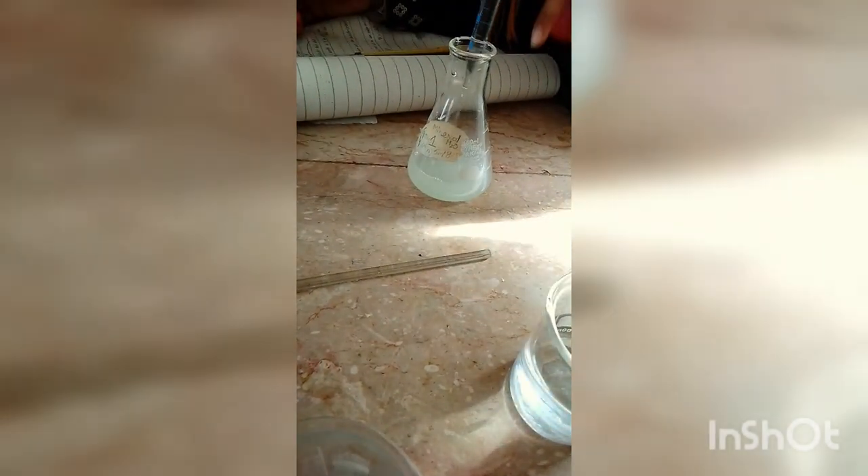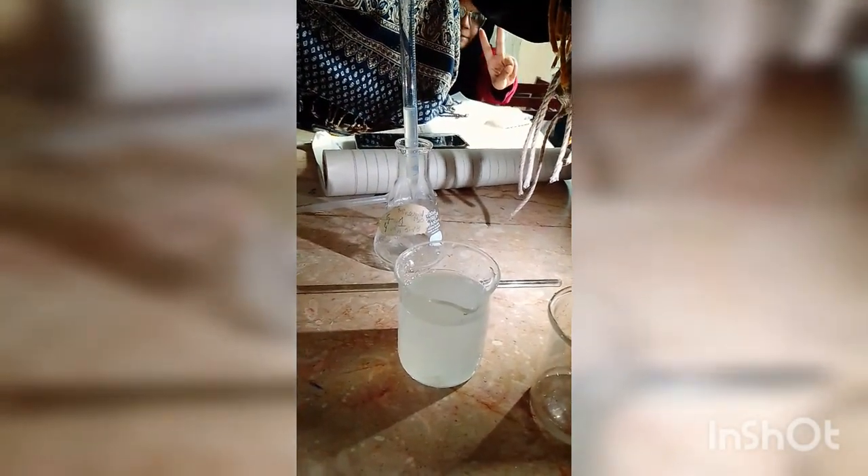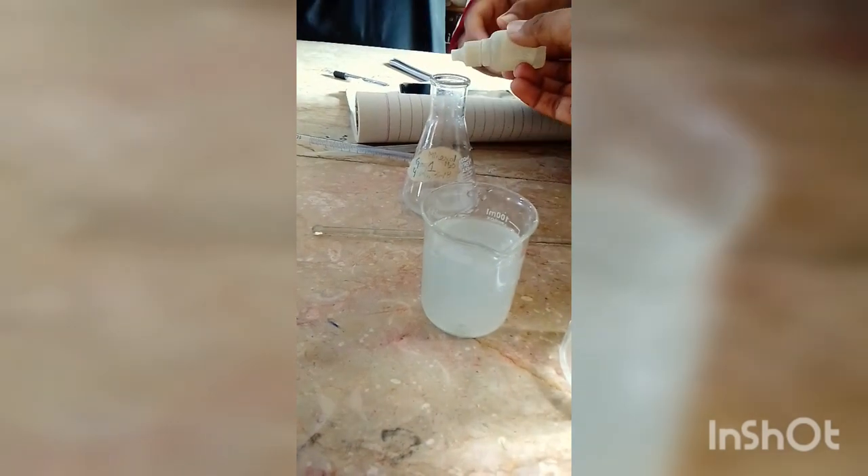In the conical flask we have the solution. We have already added 90 ml of water to 10 ml of lemon extract. Now we are adding 10 ml of this lemon solution into a conical flask so that we can perform the titration.